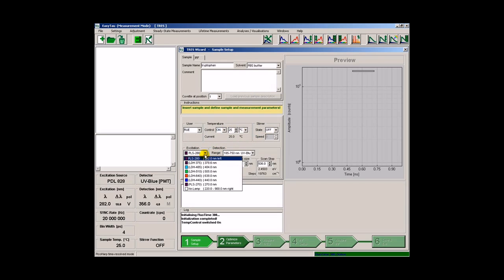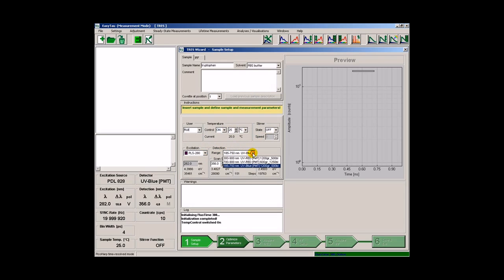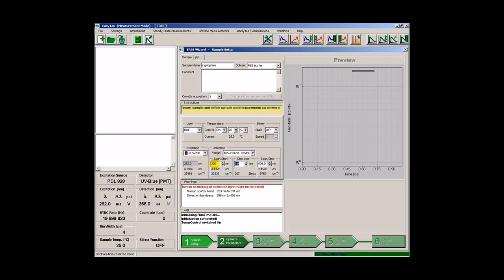in this case a 280 nm LED and the range of the detection. We will use the UV blue PMT. We select the wavelength range from 300 to 460 nm and a step size of 5 nm. Our time-resolved emission spectra will consist of 33 steps.